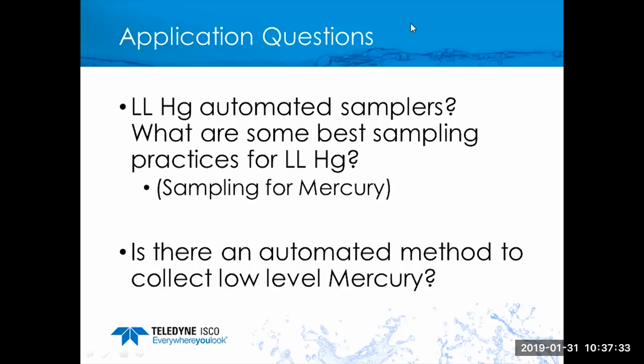There was a question that came in here that pertained to the previous question about stormwater sampling. Is there any way to prevent debris during stormwater sampling? Well, in a nutshell, no. Stormwater, especially if you have a good gully washer, is going to wash off debris.